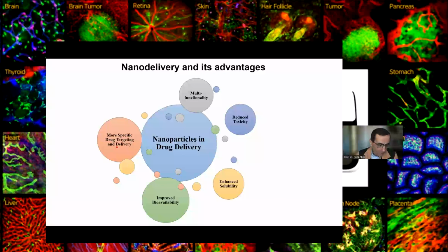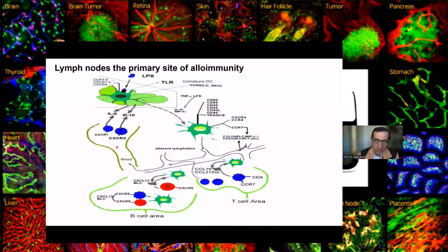And I think if you can connect us with your AI people to build a collaboration, it would be very helpful on the academic end. I think it would be instrumental. And we are interested in lymph node because lymph node is the primary site of alloreactivity. We put organ transplants in mice, and we are interested in imaging heart and lung. And I assume if you can image the lung, you should be able to image the heart transplant as well.